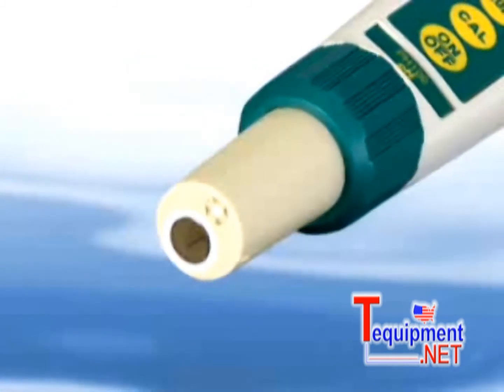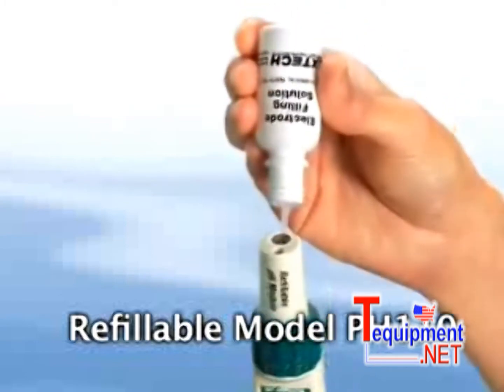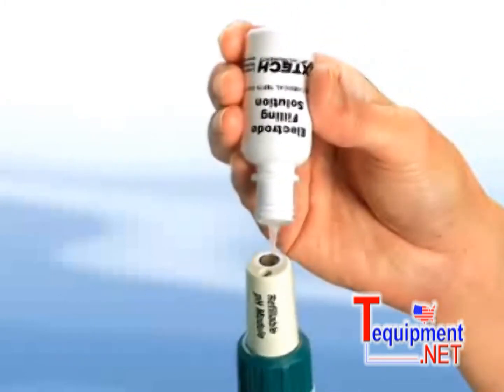Also available is a refillable pH electrode where you refill the reference solution once it depletes. This eliminates the concern of shelf life while offering you a continuous use of a high-accuracy electrode.